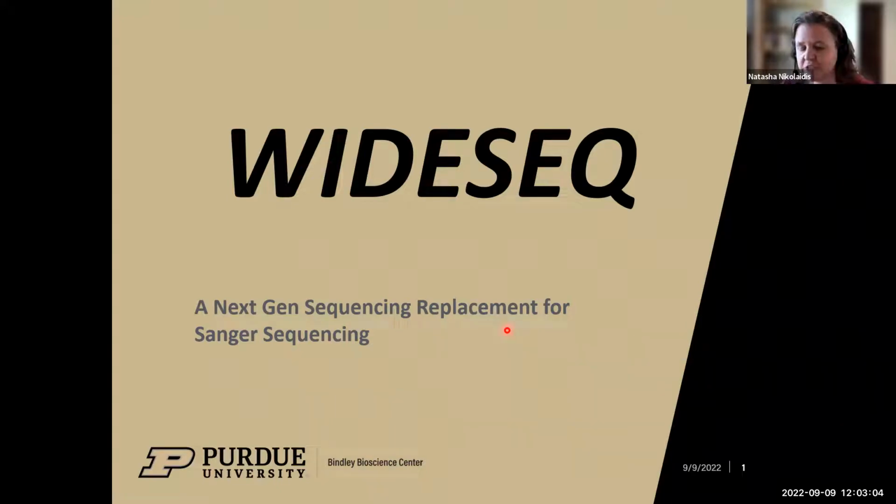So I'm very pleased to introduce Dr. Philip San Miguel, who runs our Genomics Core. And Philip is going to be talking to you today about a technique that was developed by the core called WideSeq, which is the next-gen sequencing technique that the core uses kind of as a replacement for Sanger sequencing that can do quick sequencing for faculty and researchers.